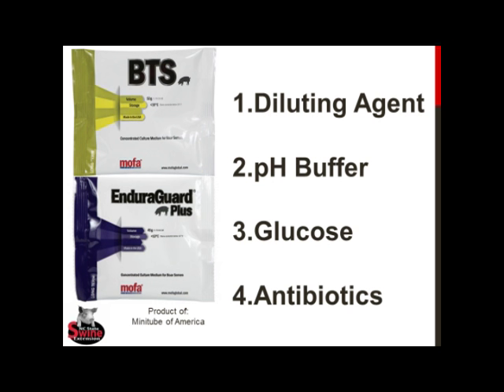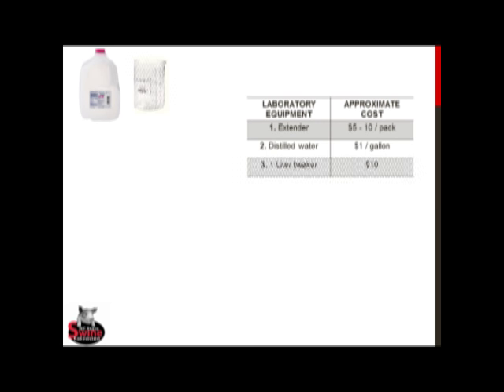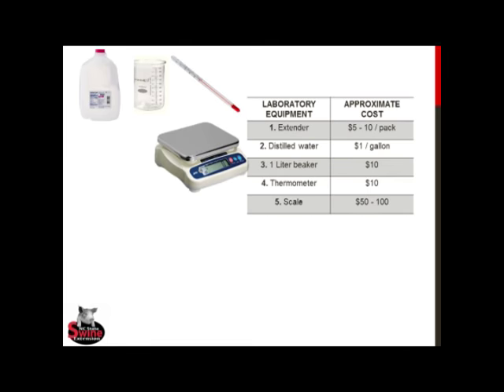The correct extender will be the one that best fits the farm's collecting, breeding, or if necessary, shipping schedules. In general, all extenders consist of a diluting agent to increase volume, a buffer to maintain a near-neutral pH, sperm nutrients in the form of glucose, and antibiotics to inhibit bacterial growth and contamination. A few pieces of laboratory equipment are also required. This includes distilled water, which is needed in place of tap water that might contaminate our solutions with chemicals or microorganisms, a beaker with a volume of at least 1 liter, and a glass thermometer. Additionally, a digital scale capable of reading in grams will be needed to determine semen volume, and a small scale can be purchased relatively inexpensively.